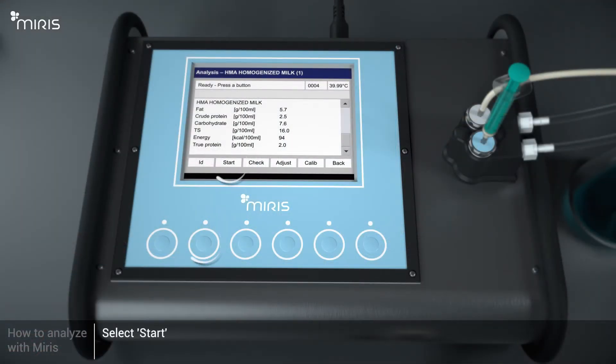Select Start to begin the analysis. Wait approximately 60 seconds for results to appear. The results are presented: the content of fat, crude protein, carbohydrates, total solids, energy, and true protein is displayed.